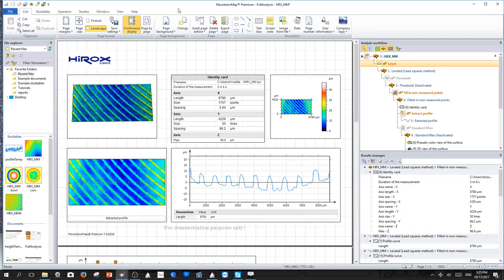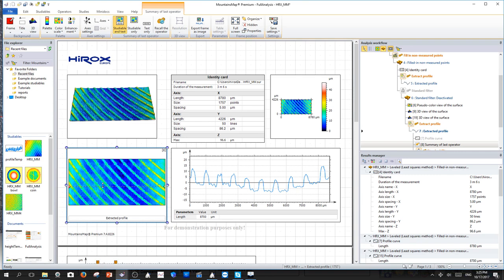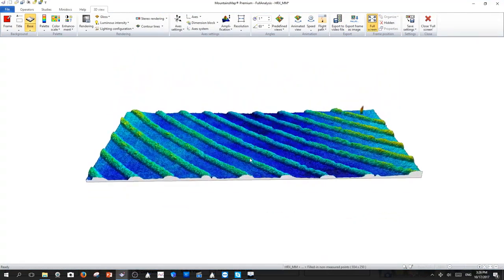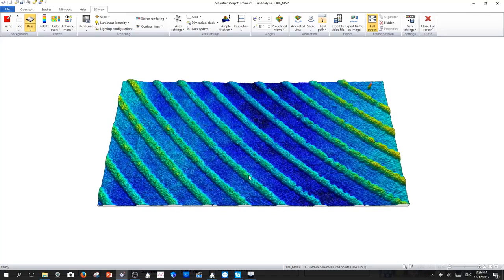And this is the result after 3 minutes of scan. So we have a fast and accurate profile on 50 lines. However, we don't have a very high resolution in the y-axis, as here the 50 lines are quite far apart. The measurement here is correct for each of the lines, and if you want to have a higher resolution, then you can do for example 250 lines, which looks like this, and it has much higher resolution in X, Y, and Z. Z has no changes, but the X, Y here has been improved, mostly the Y.